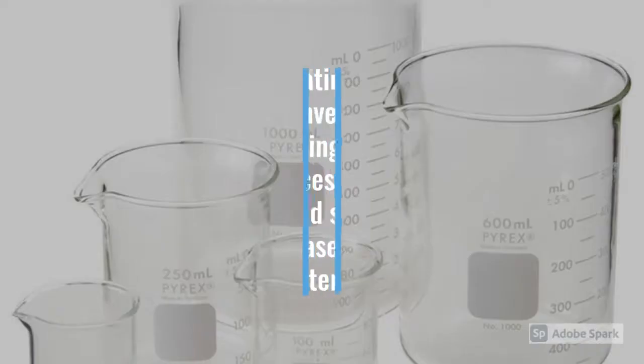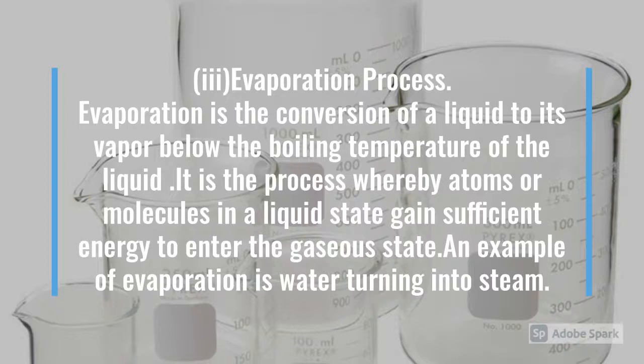Now let's move on to the process of evaporation. This is the conversion of a liquid to its vapor below the boiling temperature of the liquid. It is a process whereby atoms or molecules in a liquid state gain sufficient energy to enter the gaseous state. An example of evaporation is water turning into steam.